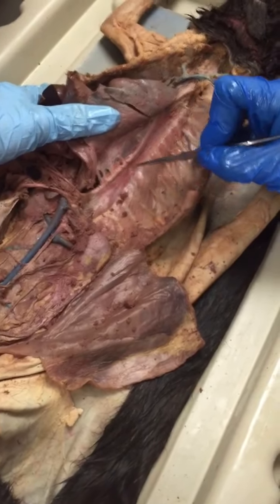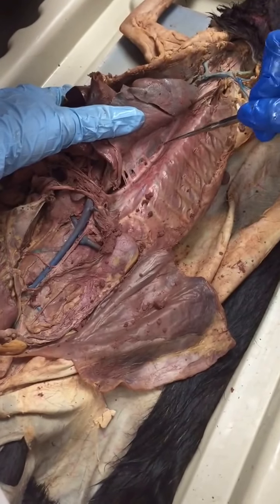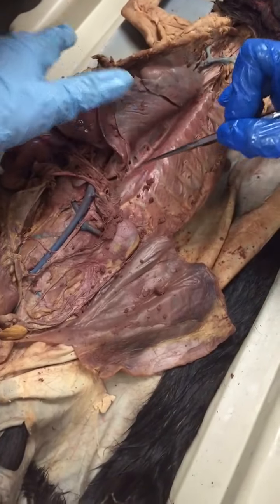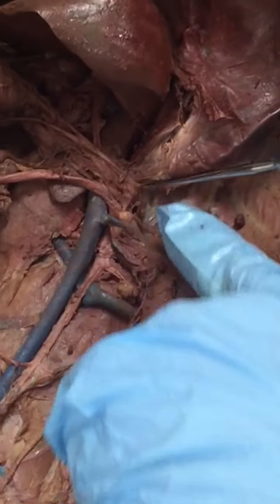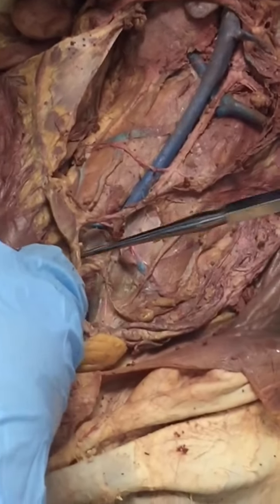Okay, on the back side here is the dorsal aorta, right, coming off of the aortic arch, which we reviewed yesterday. It also has the intercostal arteries coming off of it. So now we're just past the diaphragm here, and the dorsal aorta runs all the way down here until it splits into the external iliacs down here.